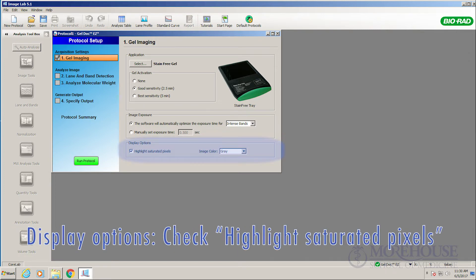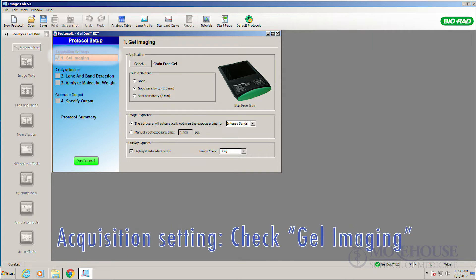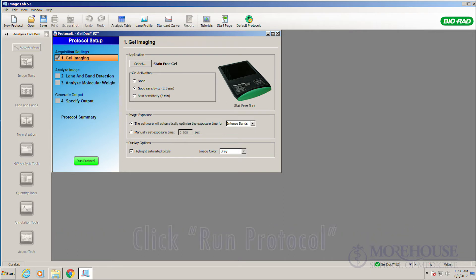Display options. Check highlight saturated pixels. Image color. Gray or other color. Acquisition setting. Check gel imaging. Click run protocol.